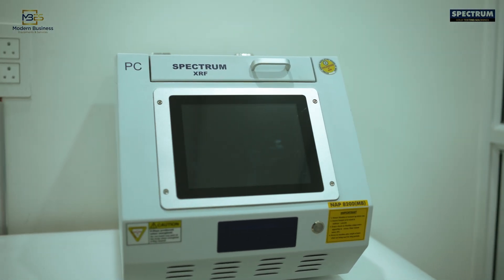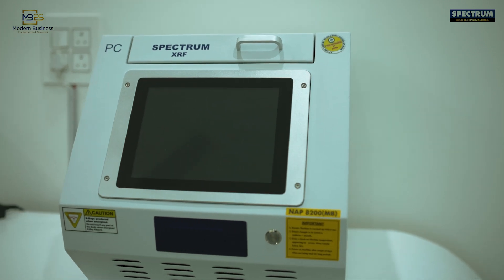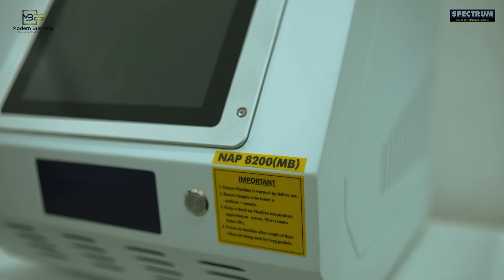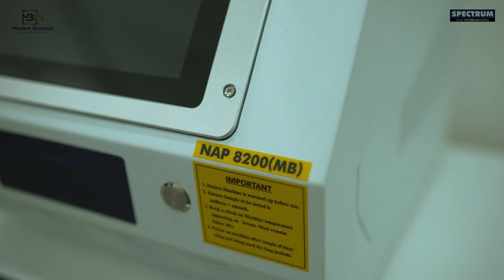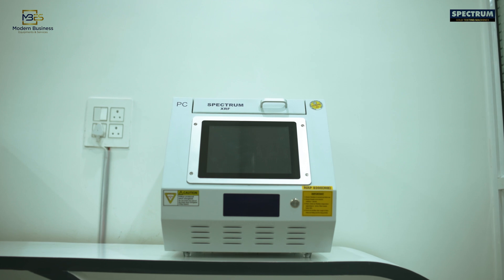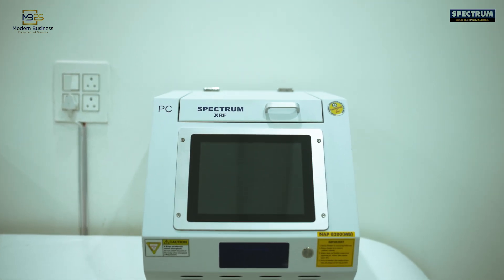We are proud to introduce one of India's most accurate and easy-to-operate gold purity testing machines, Spectrum NAP8200, specially calibrated to Indian gold for accuracy. It is compact with a built-in computer and touchscreen keypad, takes less space, and is ideal for jewellery stores.